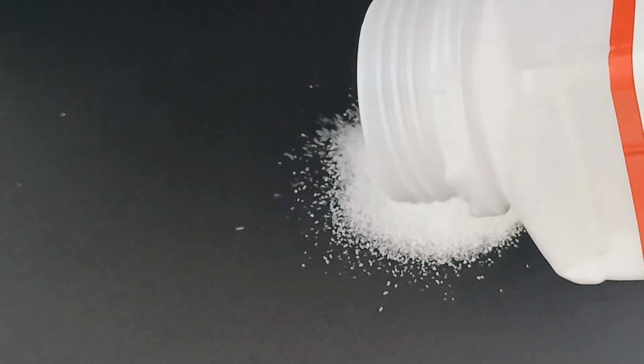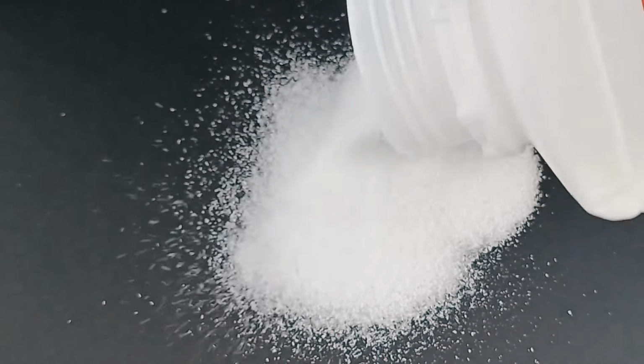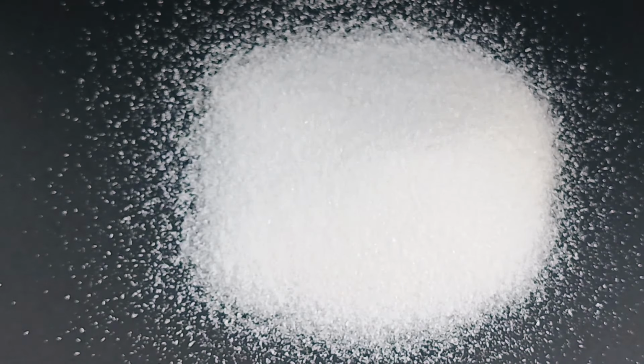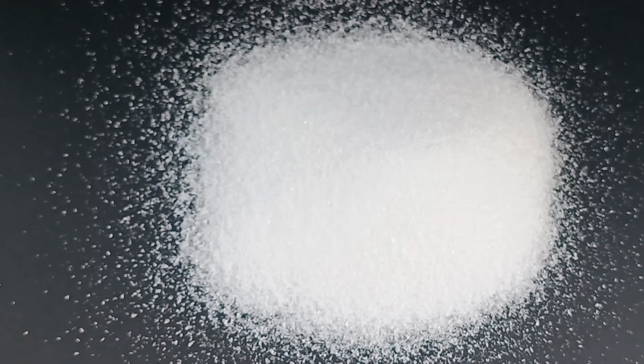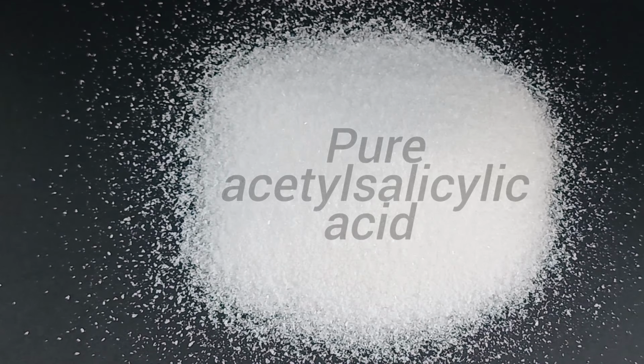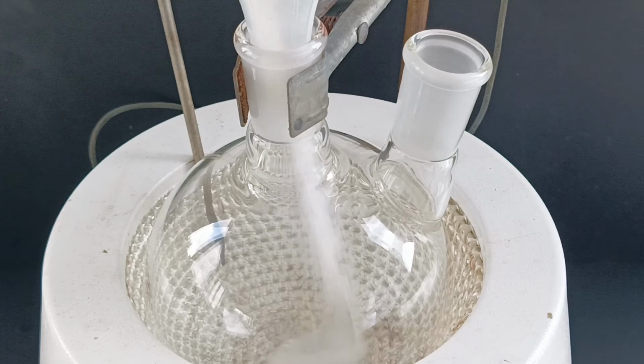If you only have access to aspirin tablets, you can extract the acetylsalicylic acid from the tablets by grinding them and mixing them with hot ethanol. Then filter off the insoluble stuff and cool the ethanol down to allow acetylsalicylic acid to crystallize. I was able to have access to pure aspirin online, so I don't need to do this step. So, let's begin with the synthesis.